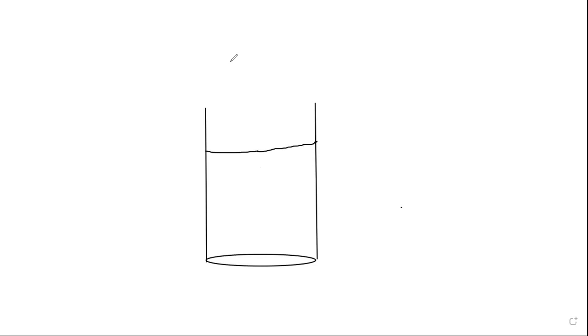And inside the distilled water, I am putting this dialysis bag in the form of a chocolate. So chocolate सारखं दिसतं ना हे मस्त. And inside this dialysis bag, I have this sample.